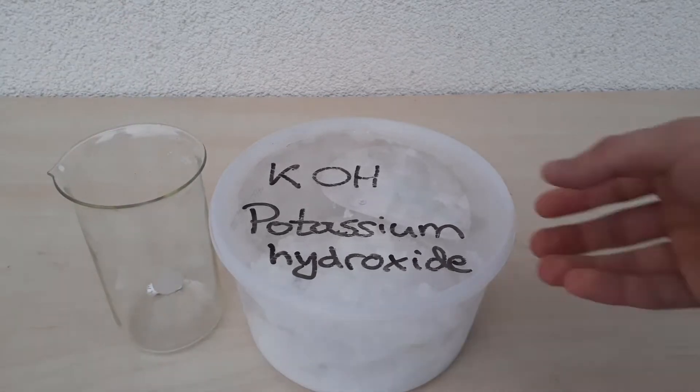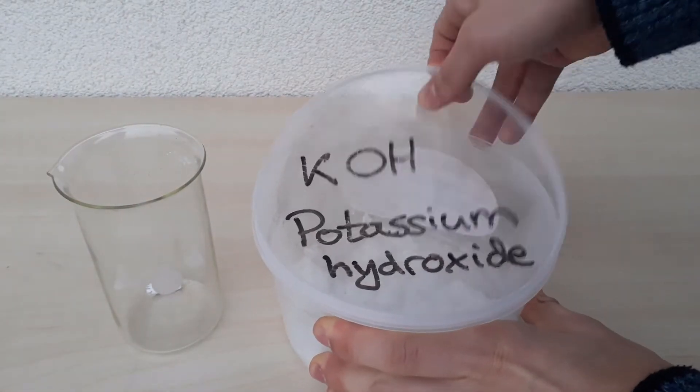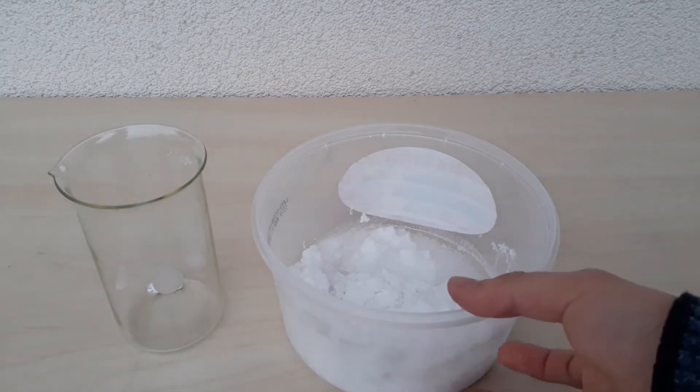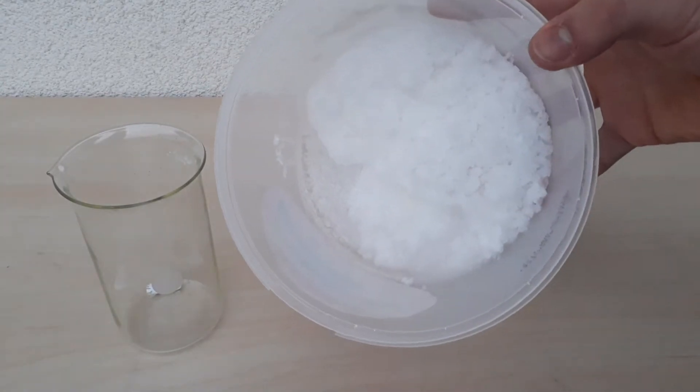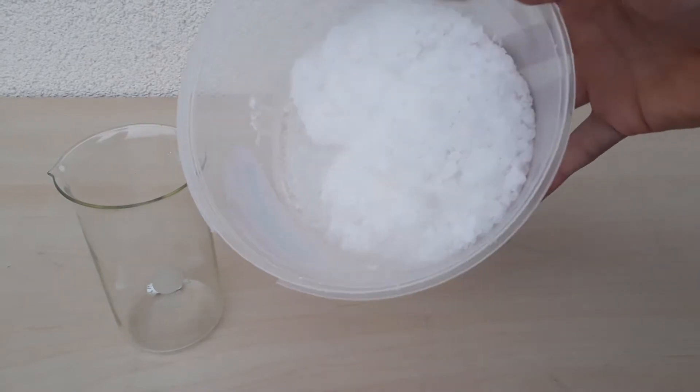Making potassium sulfate is really easy. I started off with this very hygroscopic potassium hydroxide, which I have neglected for so long that it started picking up excessive amounts of water from the air.